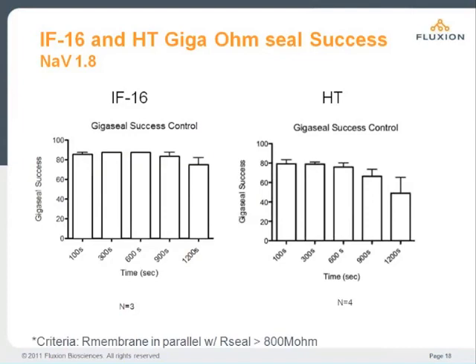Shown are average values from a set of experiments done on the IonFlux 16 on the left, or experiments run on an IonFlux HT, on the right, showing the measurements at different times through the experiment up to 20 minutes.